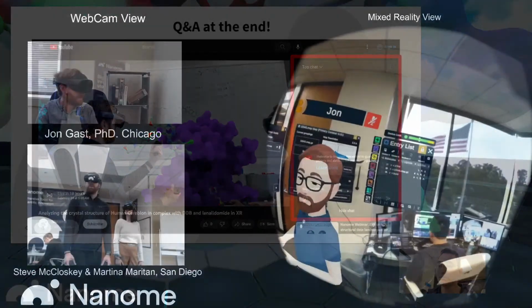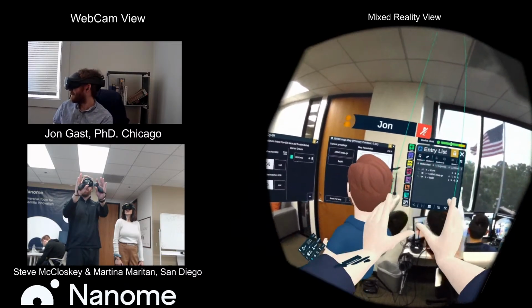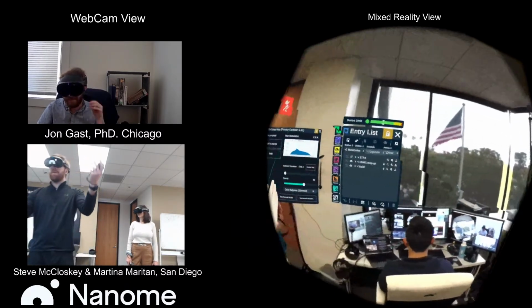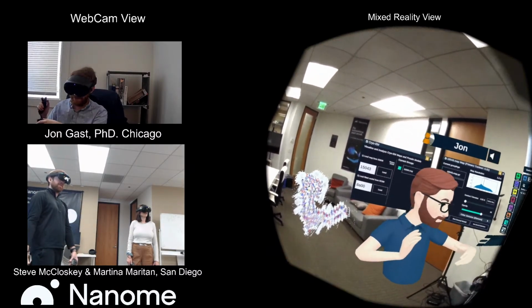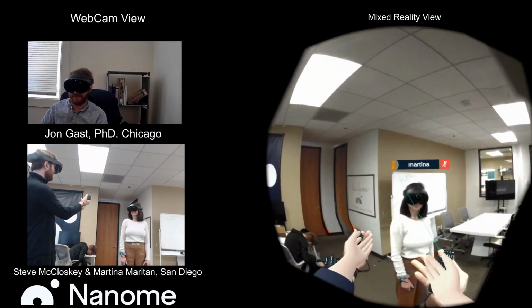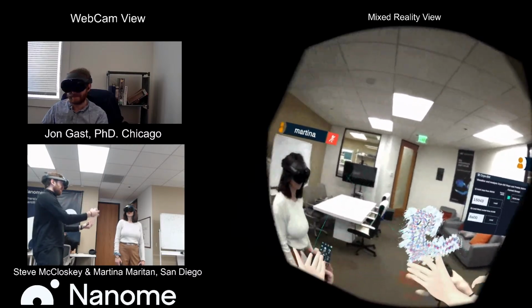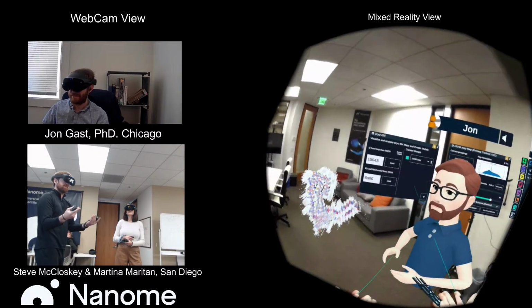Fantastic. Thank you, Keda. So I am joining you all live from the Quest Pro headset in mixed reality. We can see that we have Keita operating the streaming equipment, Mark helping out. This is our office down here in San Diego. And then of course we have John joining us from Chicago, and then we have Martina joining me in real life. So you can see Martina here in real life. She's going to be working with me, and then we have John joining virtually. So you can do this sort of co-located mixed reality as well as a collaborative mixed reality with remote users.